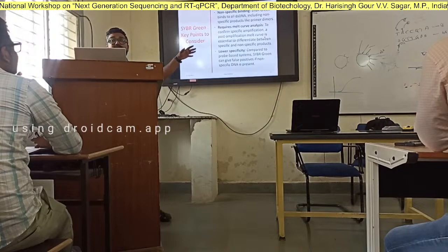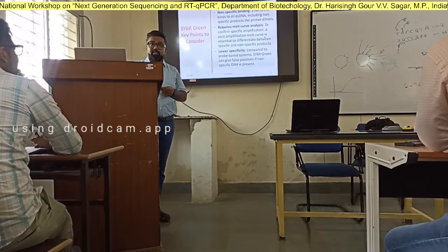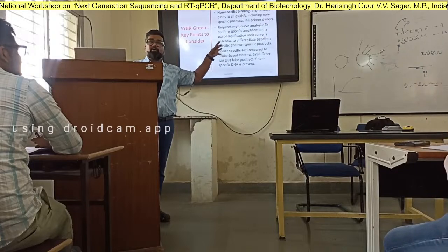So always make sure that your primers, and this is true for anything, आपके पास information है, go to NCBI, go to Primer BLAST. There is a specific area where you can check all these things, and make sure that your primers span an exon-exon junction.